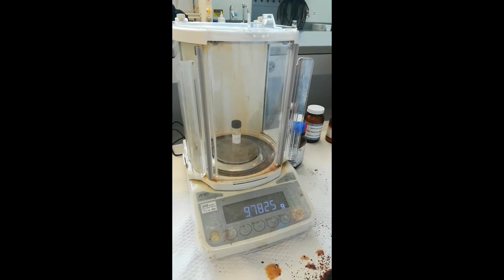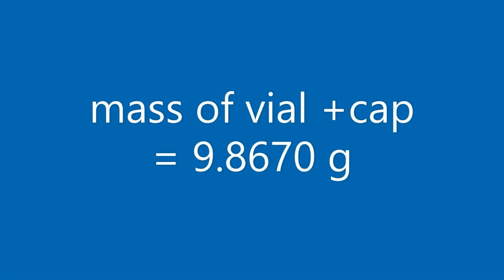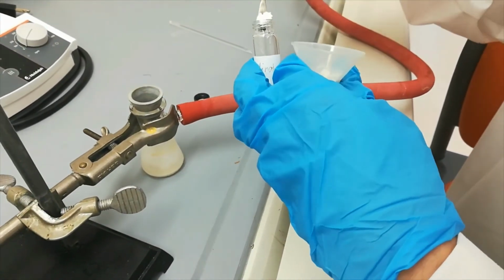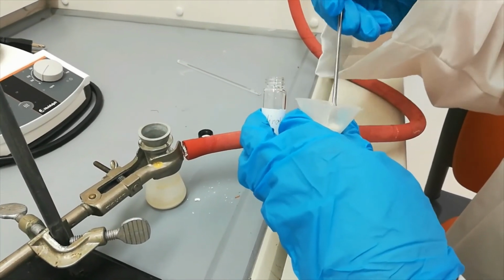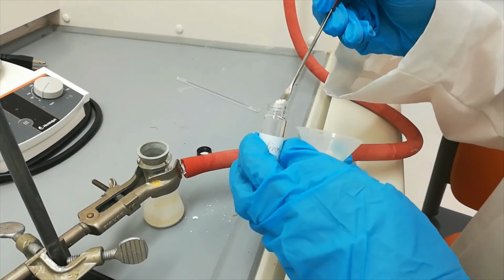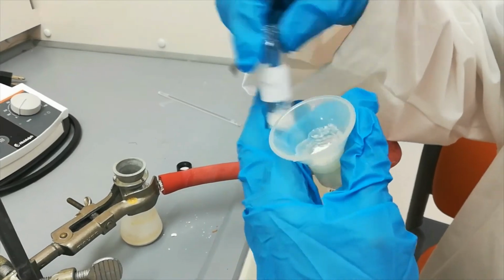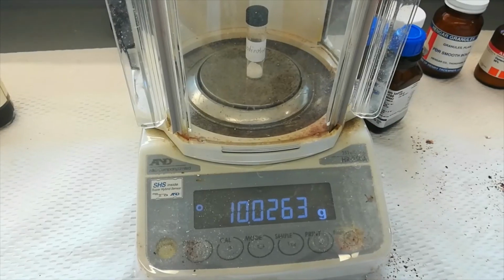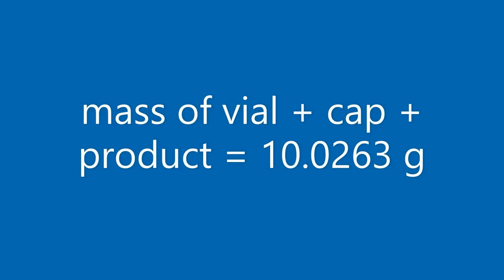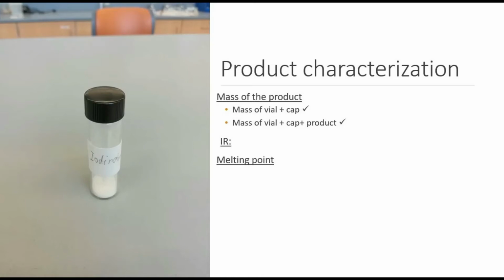While the crystals are vacuum drying, we take the mass of an empty vial. When the product has been vacuum dried for about 5 to 10 minutes, we take the Hirsch funnel and transfer the product from the Hirsch funnel into the product vial. Then, as usual, we take the mass of the vial with the product in it.